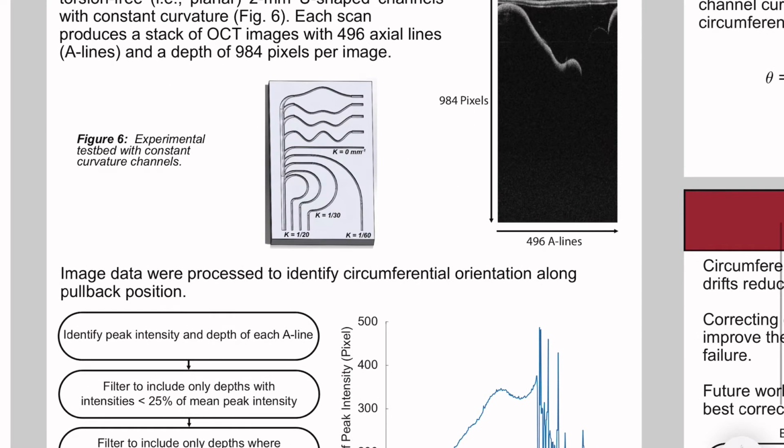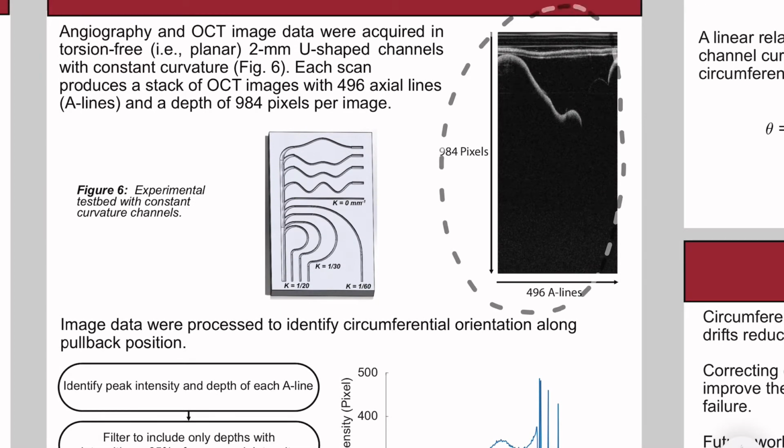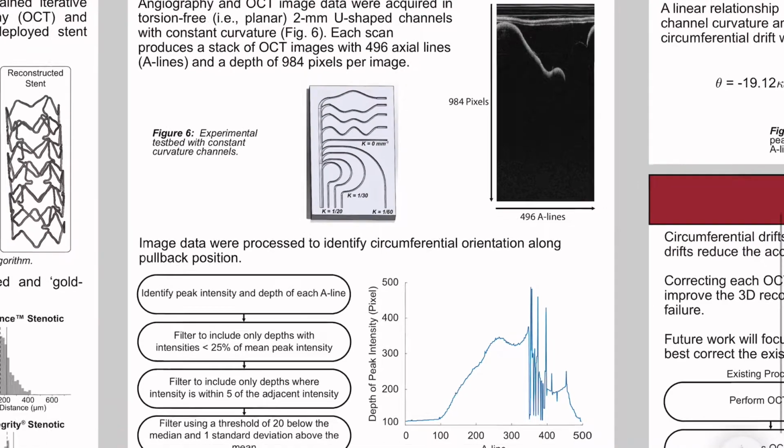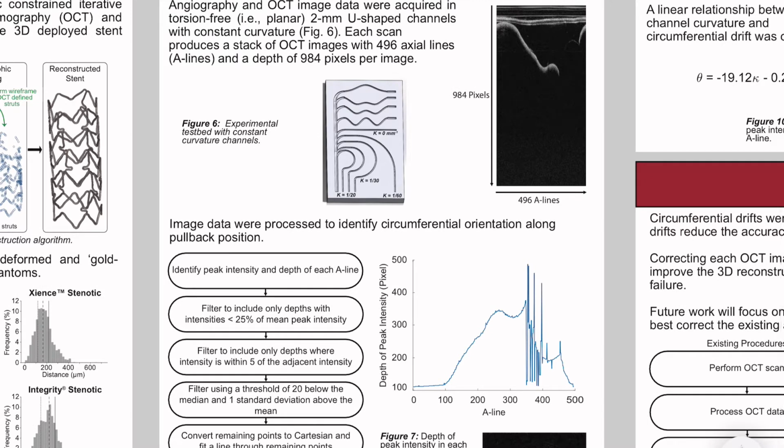First, an image was viewed in its polar form, as shown here. A peak intensity depth profile of this image shows the region we want to identify as the U-shaped spot in this bottom corner.